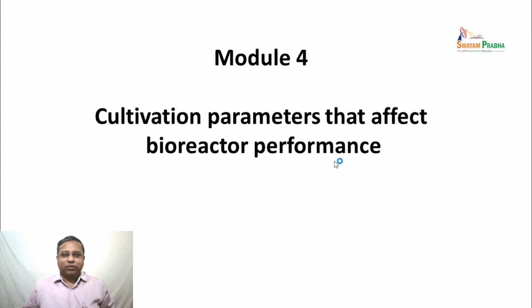In module 3, we looked at the analysis of the common modes of operation, so that it would be useful for some design decisions. In this module, module 4, we would look at the cultivation parameters that affect bioreactor performance.